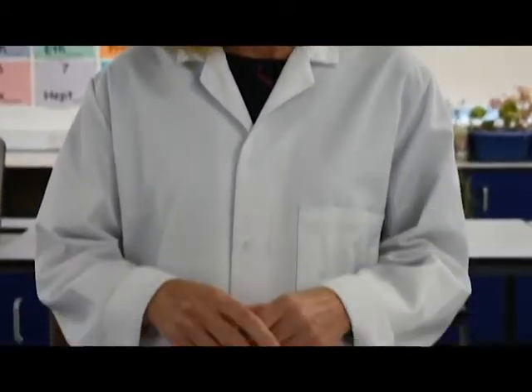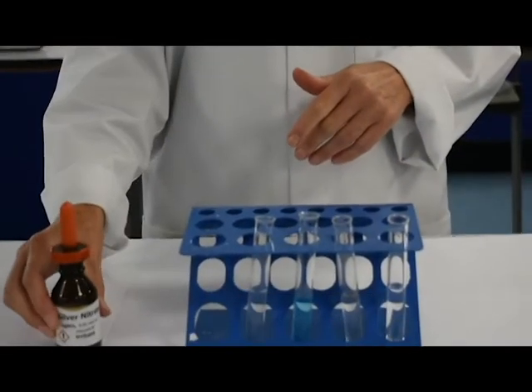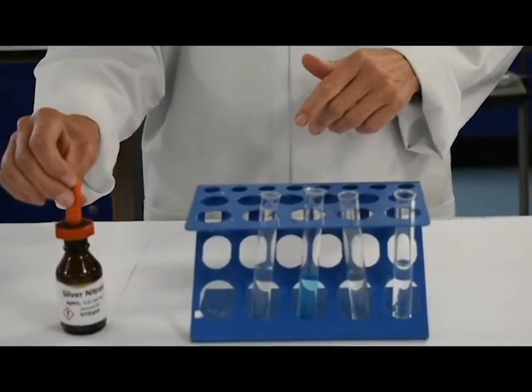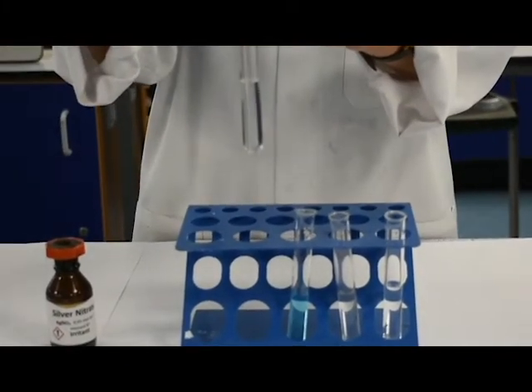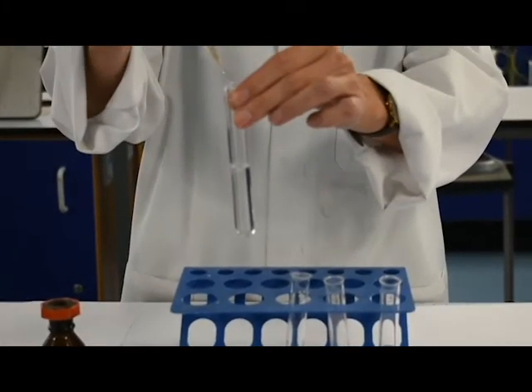Hi, my name is Janet and I'm one of the chemistry teachers here at QE and I'm going to show you the silver nitrate test which tests for chloride ions. So here I have my 4 solutions A, B, C and D and I have some silver nitrate solution. So I'm going to add a little bit of silver nitrate solution to each of these. You need to record these results in your results table.